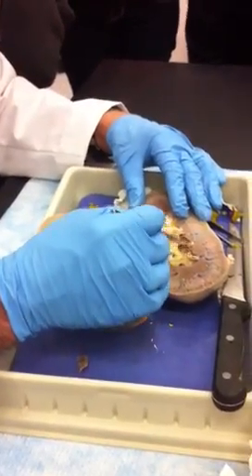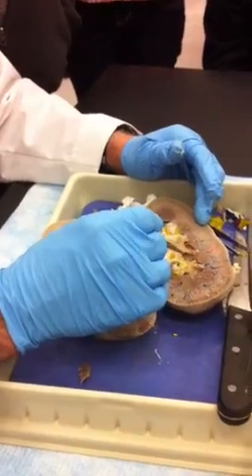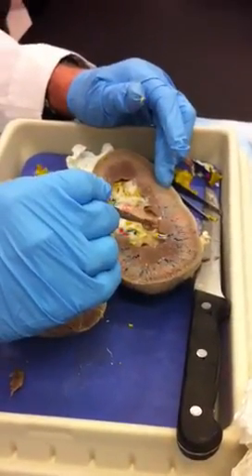Now this guy right here — you wouldn't think it is, but this is a minor calyx right here. And that nipple tip right there is a papilla.